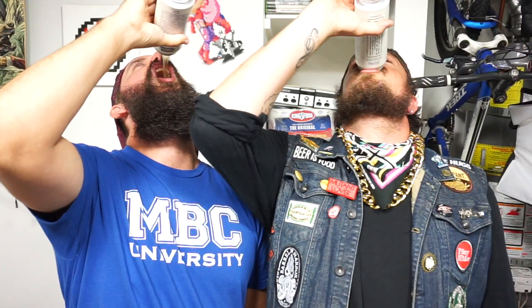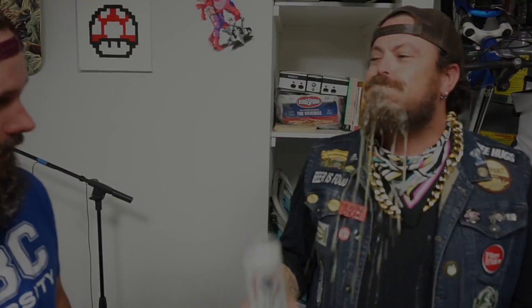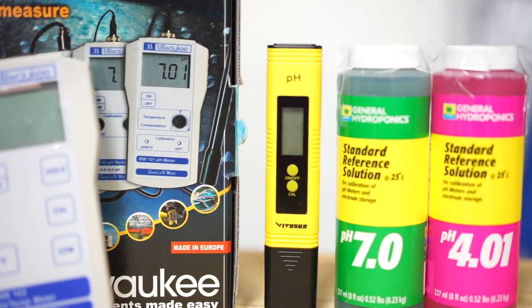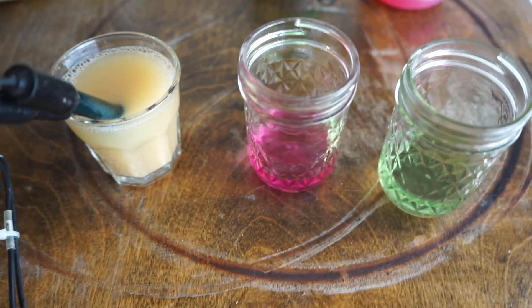Your sour beer is going to suck unless you watch this video. In this video, you're going to learn about what pH is and what products you're going to want to buy. And most importantly, how to calibrate your pH meter so that your sour beers get the perfect amount of acidity.